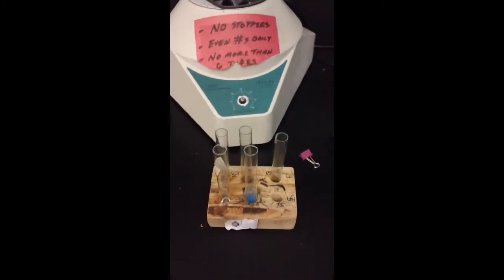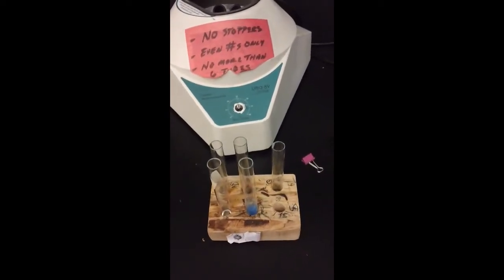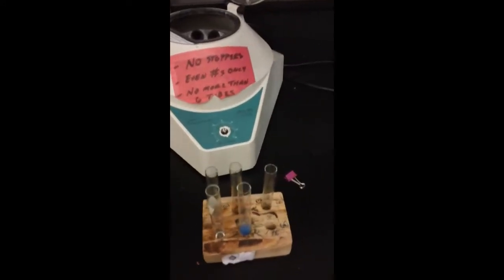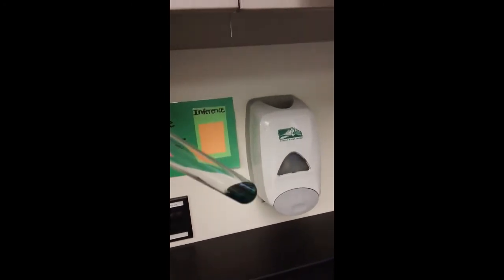Okay, welcome back to test C after centrifuging. So now we're going to take another look at our chemicals, and we're going to see if for these known 5 substances, a solid formed or is noticed after centrifuging. So this is after centrifuging, test C. First we're going to start with our Cr. Do you notice a solid? It looks like it's only a liquid and that it's a dark green, kind of translucent liquid.